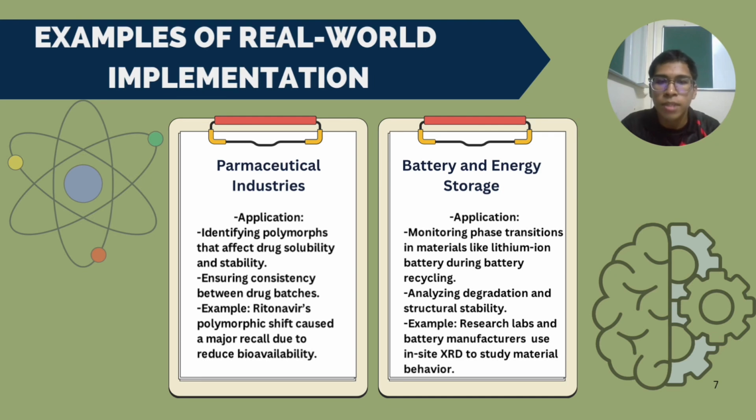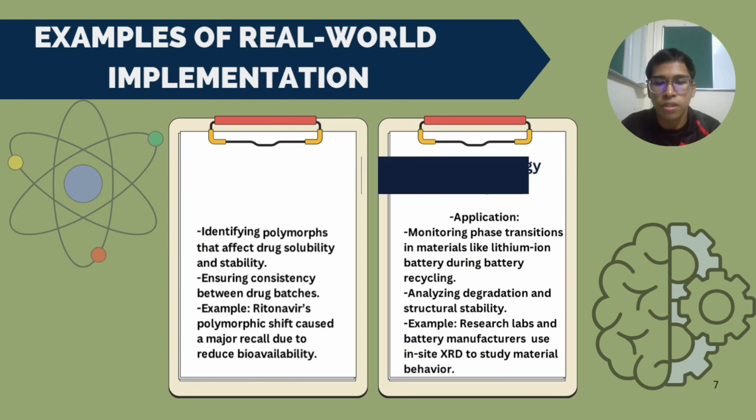Second, battery and energy storage. Their application is monitoring phase transitions in materials like lithium-ion batteries during battery recycling, and also analyzing degradation and structural stability of the battery. For example, research labs and battery manufacturers use in-situ XRD to study material behavior. Okay, on to the next one.